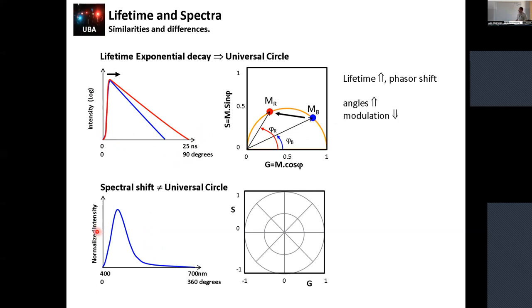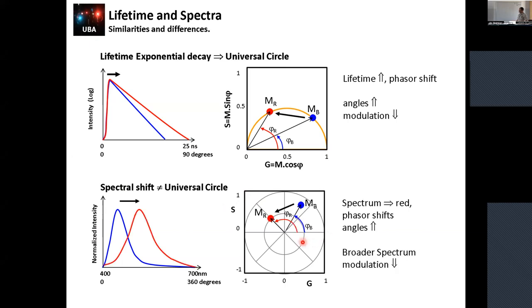And we also have a function that can be fluorescent, with a certain maximum and certain bandwidth, that can be transformed in our phasor as a point with a certain modulation and a certain phase. And this transformation will capture basically the spectral shift as well as the broadening of the spectra, by changing the phase, which refers to the maximum or the center of mass of the spectra, and the modulation will capture how broad or narrow our spectra is.